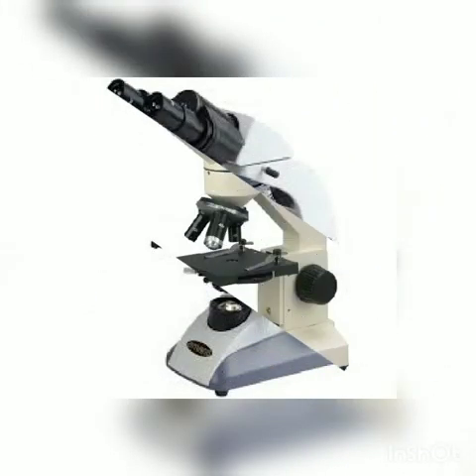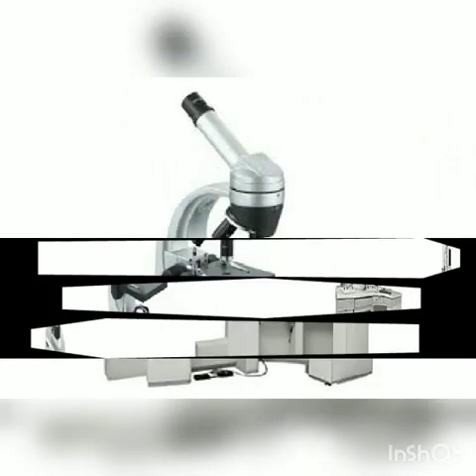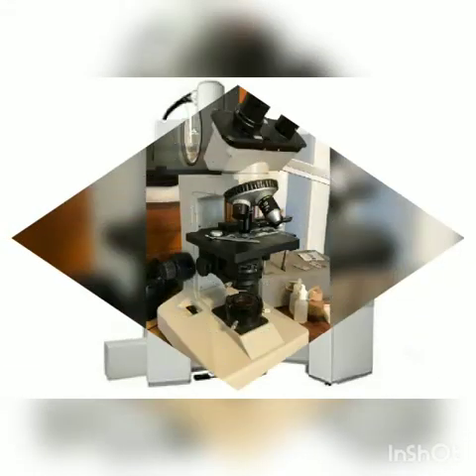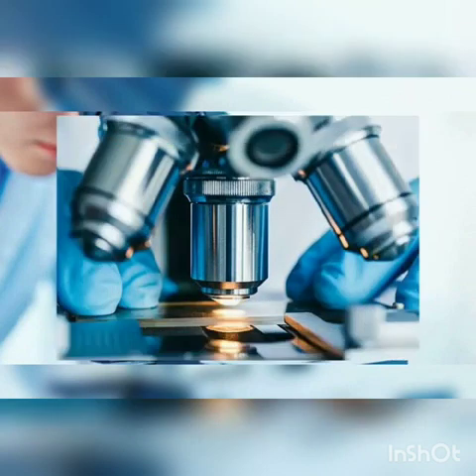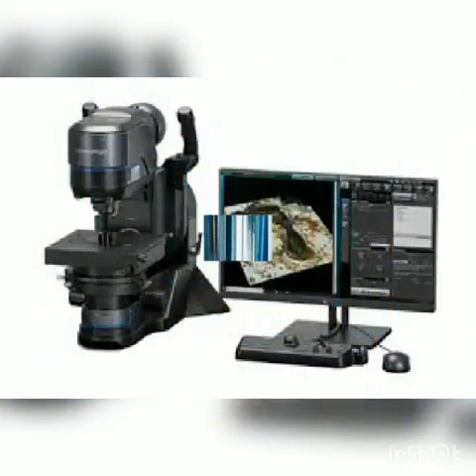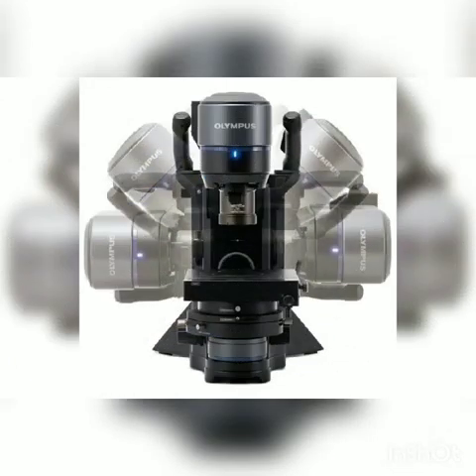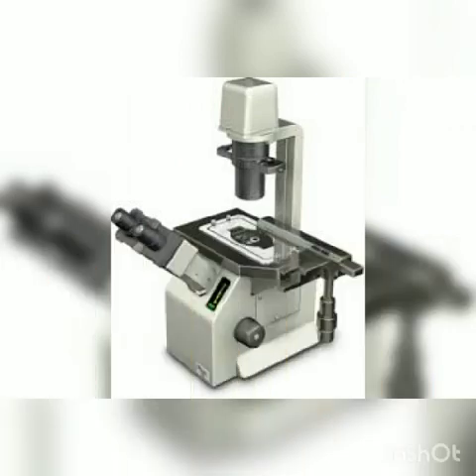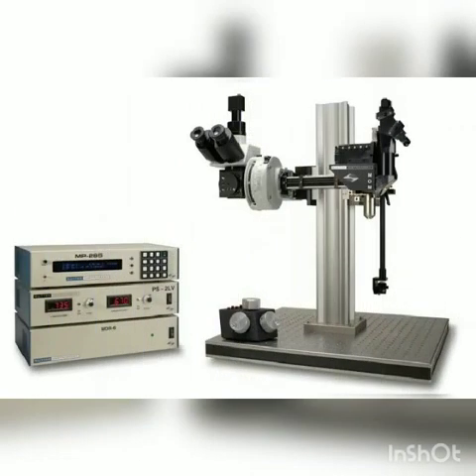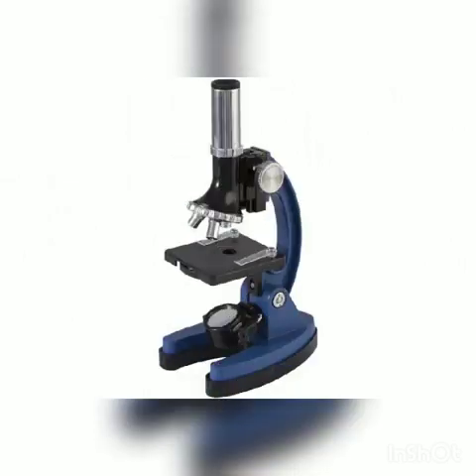There are many types of microscope and they may be grouped in different ways. One way is to describe the way the instrument interacts with a sample to create an image, either by sending a beam of light or electrons to a sample in its optical path, or by scanning across, at a short distance from the surface of a sample, using a probe.